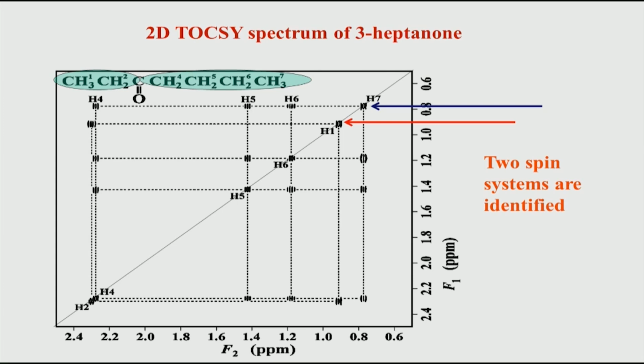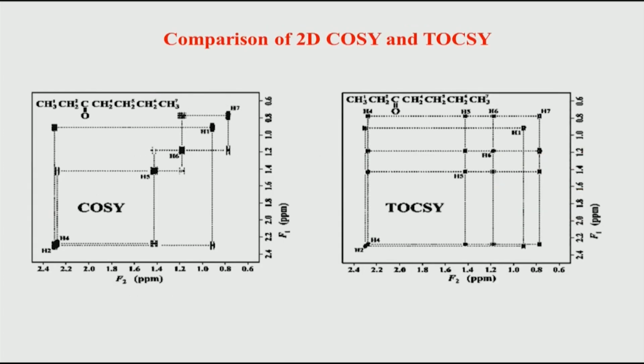J coupling is not there between hydrogen of one amino acid and the hydrogen of a neighboring amino acid. So, there is a break because of the peptide bond, and we say that one amino acid is isolated as far as proton J couplings are concerned from the neighboring hydrogens, and we use the word spin-spin coupling. So, this is an example.